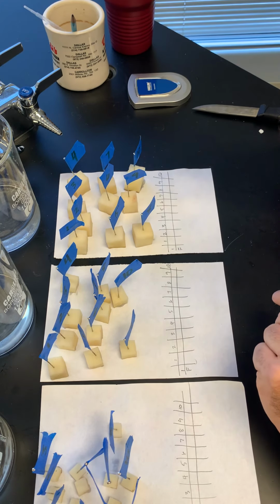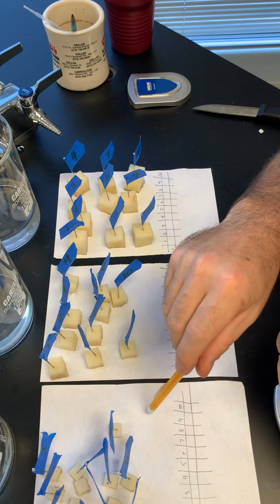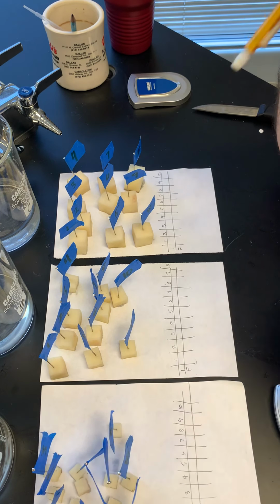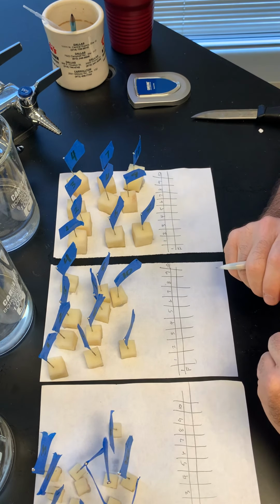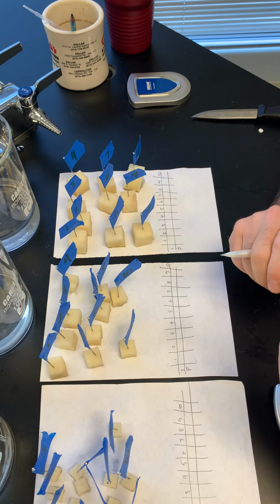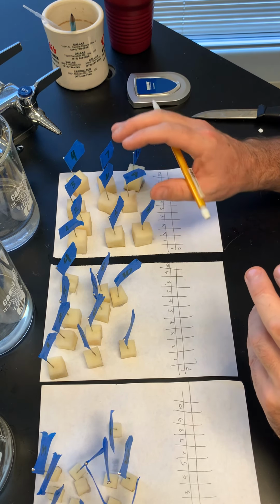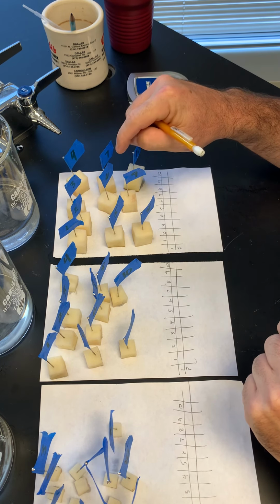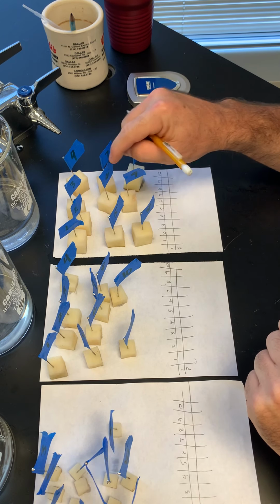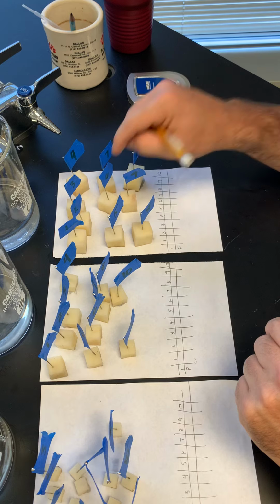So I'm going to predict that the 1 cubic centimeter is going to have the fastest rate of osmosis. That's my prediction. And I know that because the smaller you are, the higher your surface area to volume ratio is. As you get bigger, surface area starts to decrease relative to volume. Volume grows more rapidly than surface area. So these are going to have less surface area relative to their volume, and that should slow this down.